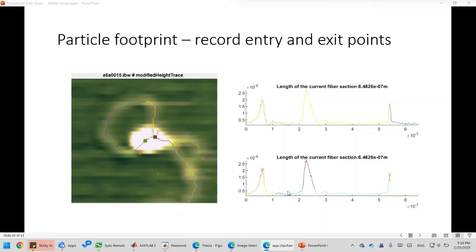And the trace profile is also segmented the same way as shown in the main image. Now you can see the first peak is labeled in orange. That's from 2 to 3 in orange. And the second peak is labeled in purple. That's from 6 to 7 in purple. All right, let's see how to do that in ImageMatrix.